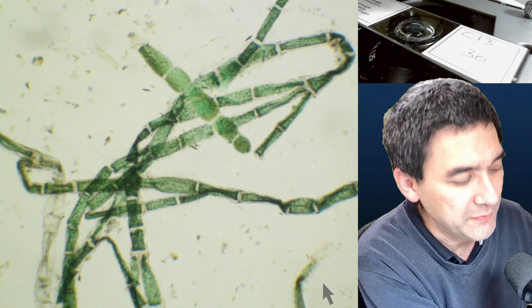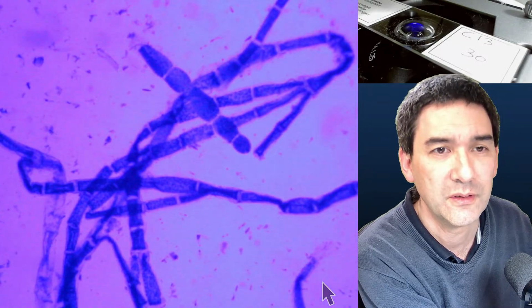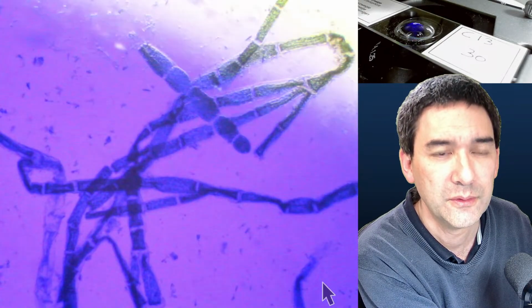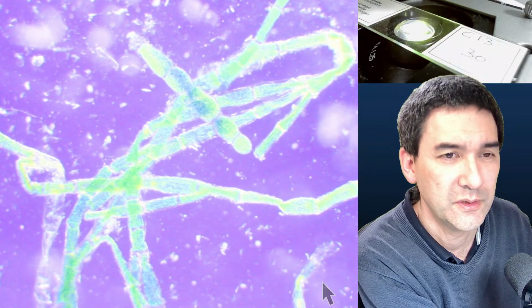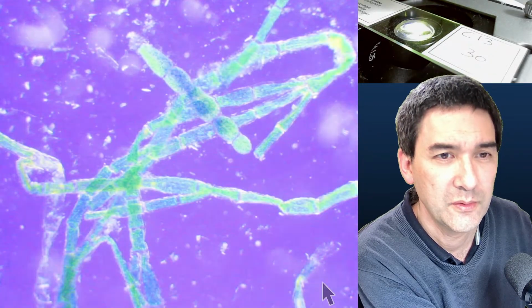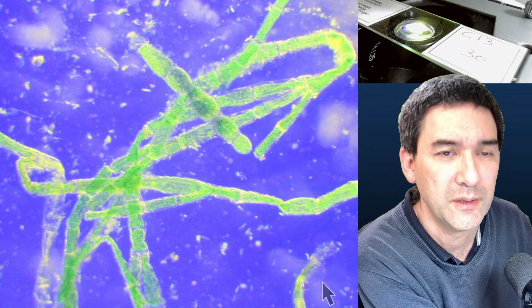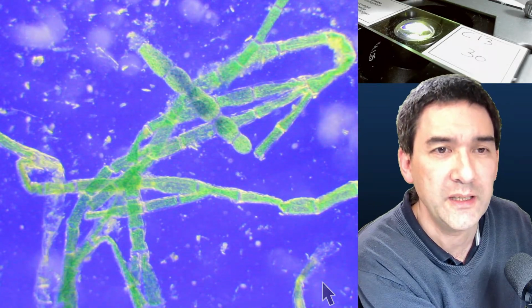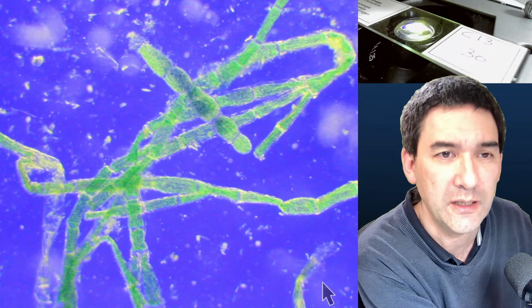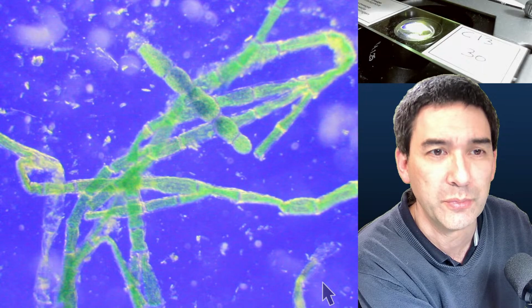And then of course we now have a mix between the chlorophyll and also the background. So we're now shining the yellow, the algae is now yellow, it mixes with the natural color green, and the background is now of course blue, as you can see here.